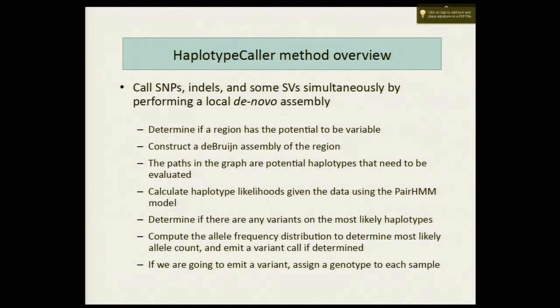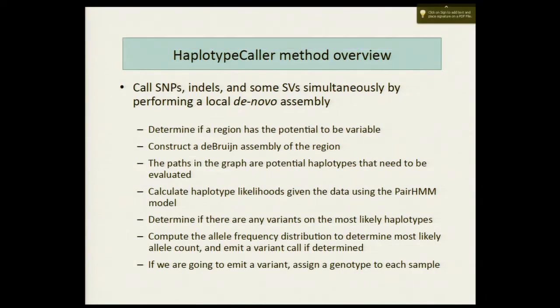It's very new, and so efficiency concerns come later for us. Eventually we'll probably do a tandem approach like you're suggesting, where we call Unified Genotyper first, and it tells us when it's not sure, and then we go back and do the full shebang with the HaplotypeCaller. That's a good idea. It's not what we do right now, though. Right now, we treat the two procedures as independent. We usually run both and just see what the differences are.